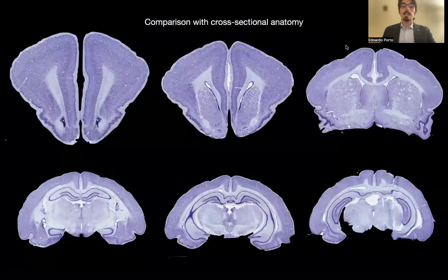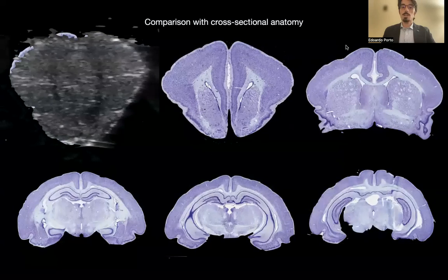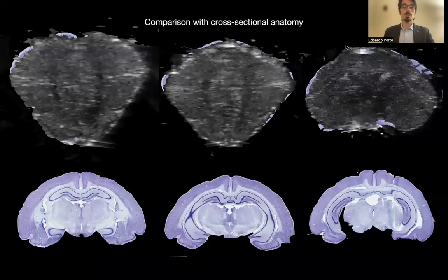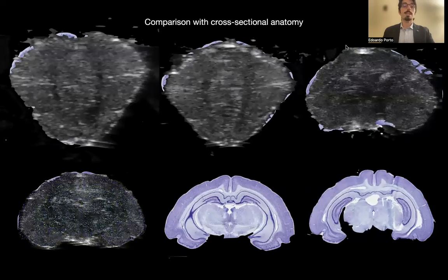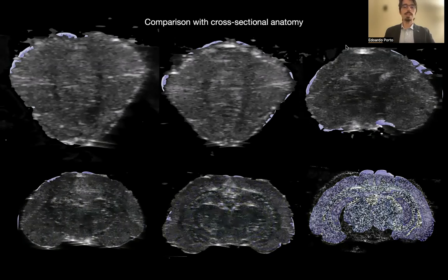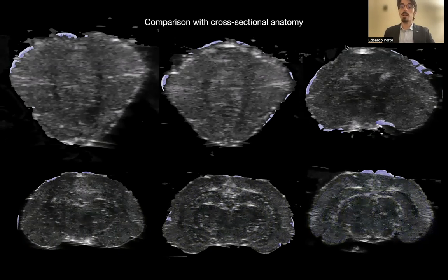So we basically selected 6 histological images readily available online from the craniocaudal axis on coronal sections, and we coupled them with some B-mode images that we acquired in sequential scanning. Of course, there is a limitation in this matching because when you use an isolated guinea pig brain, the brain lays dorsally on the pad for ultrasonography scanning, and this affects somehow the shape of the brain, which was not exactly similar to the shape of the histological section.